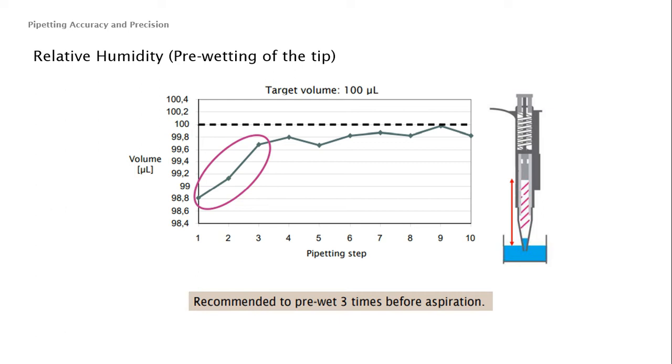So once you dispense this liquid, there is already an error in your accuracy. You cannot tell it during the aspiration and dispense, but once you measure it by validation, or by putting it in another container with markings and calibration, you can tell that it is less than the amount that you expected.